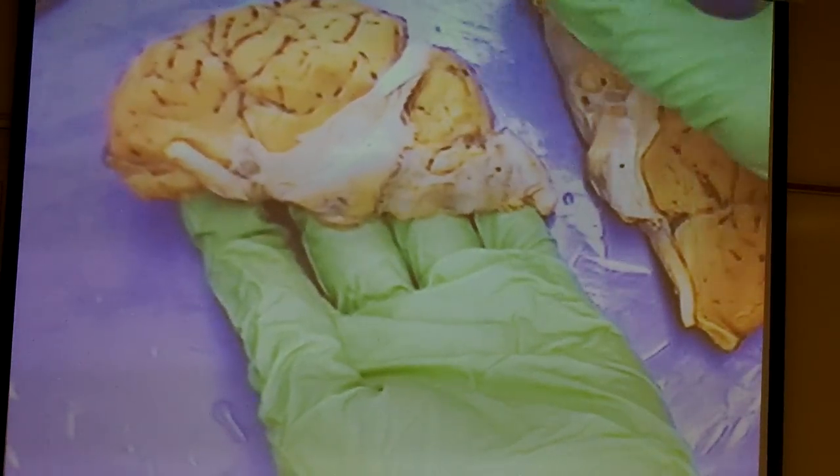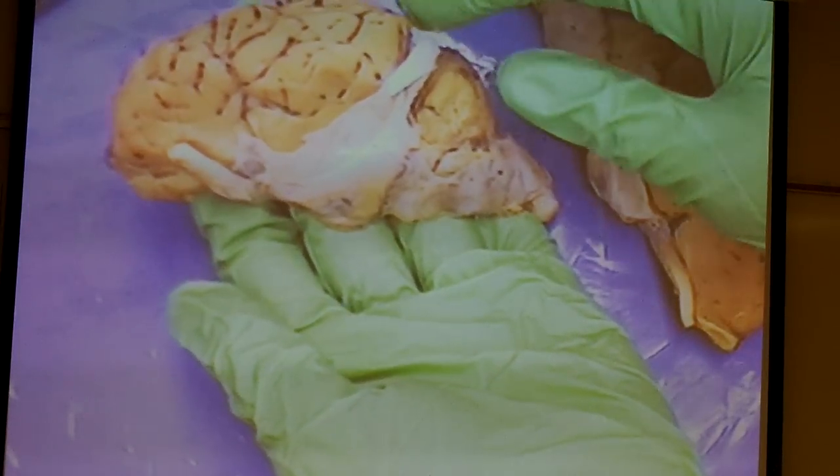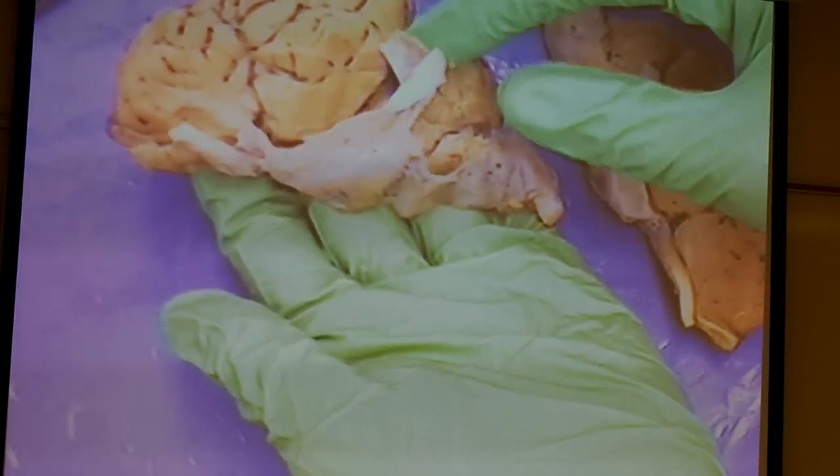The first thing that you should notice, or maybe not depending on the sheep brain that you have in front of you, is that some of them still have their meninges, the outer wrapping.